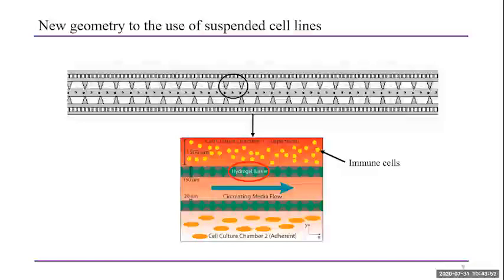So part B of my question, trying to keep to one question, is why 20 micrometers and 30? You had another slide. What dictates the size of that smaller channel? Why do you decide 20 or 30? Why not 10 or 5?